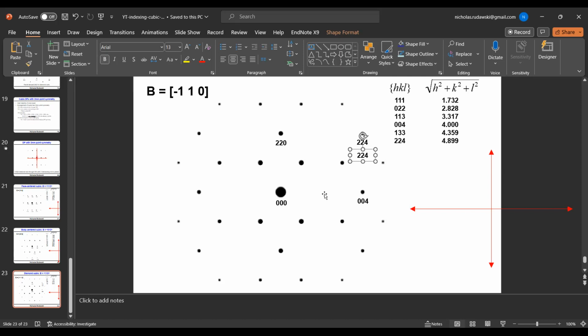Okay, so right, this spot would be half of this spot, but this spot also isn't here. So this spot would be 2, 2, 2 right here. Okay, so then what that means is that this spot has to be 1, 1, 1. Okay, so yeah, the absence, the little holes in this kind of make this a little tricky.